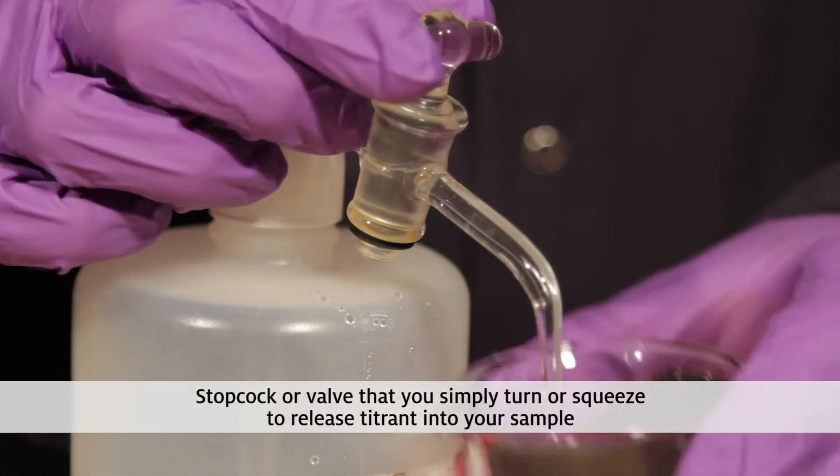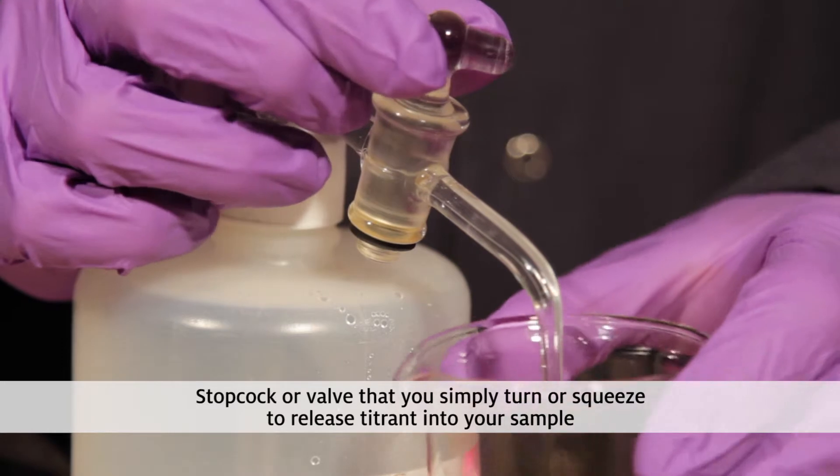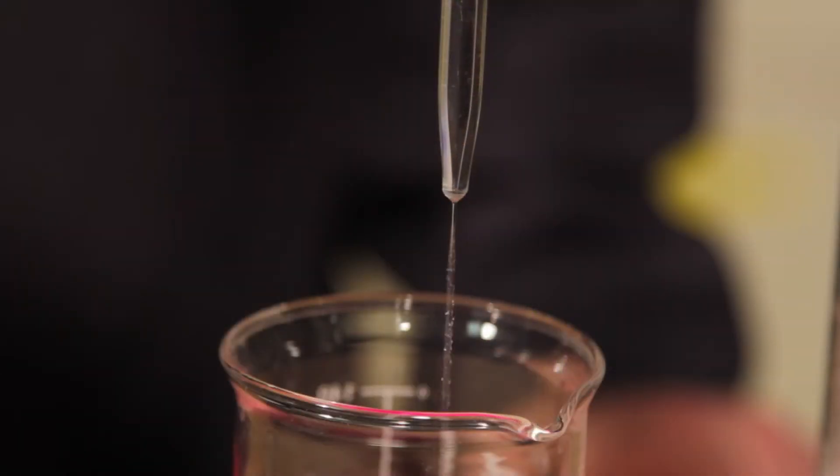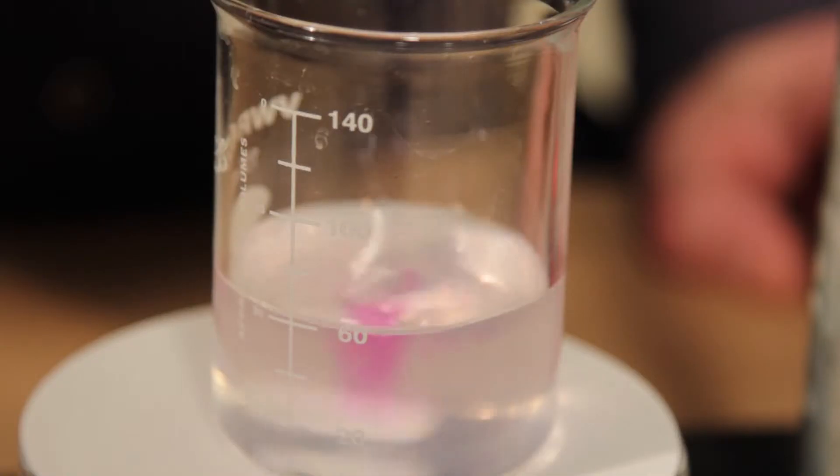At the bottom, there is a stopcock or valve that you simply turn or squeeze to release titrant into your sample. With a little practice, you will learn how to control the valve to release a rapid stream or squeeze out a single drop to perfectly hit the endpoint every time.